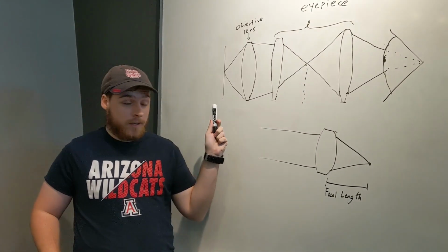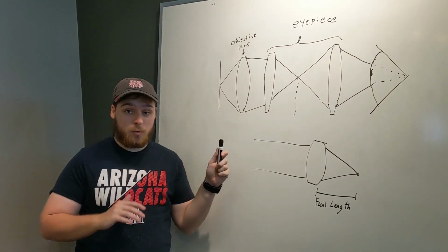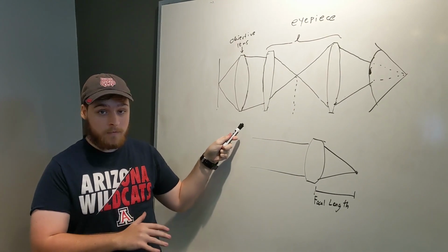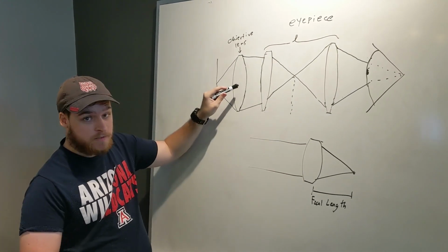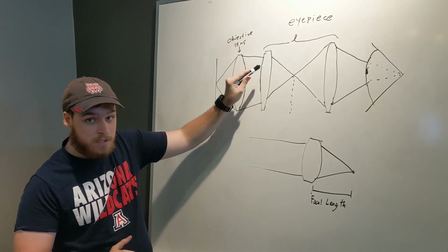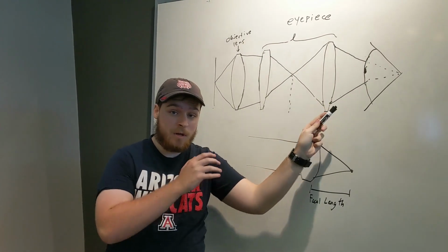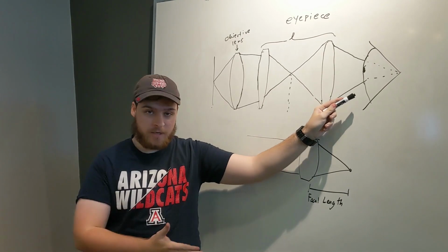So here we have a model of our microscope, and this is basically the path of light that goes through our system. In our microscope, the ratio of the focal length between the objective lens and the eyepiece lenses, focal length combined, is what determines the magnification power of our microscope. You can see here with the whole distance, as the objective lens focal length decreases, or as it gets smaller and smaller, this slope would get more steep, because the focal point would be closer. And this would ultimately result in more magnification because this slope would essentially mean the light is getting focused more and more highly in one spot in the eye, or whatever detector you have.